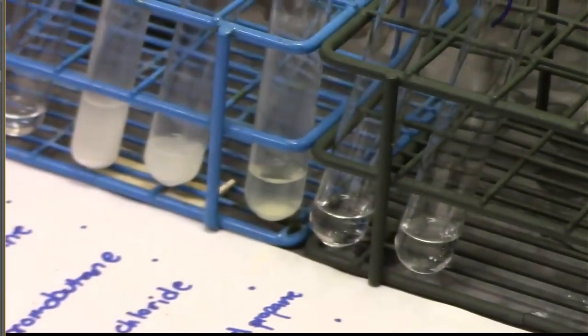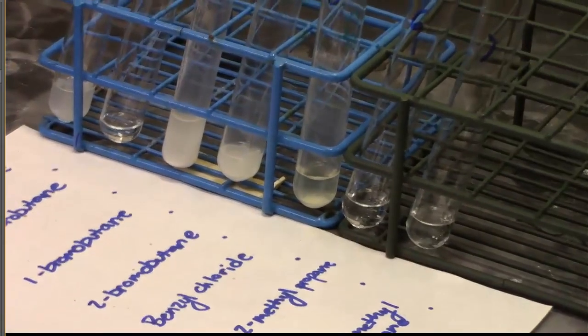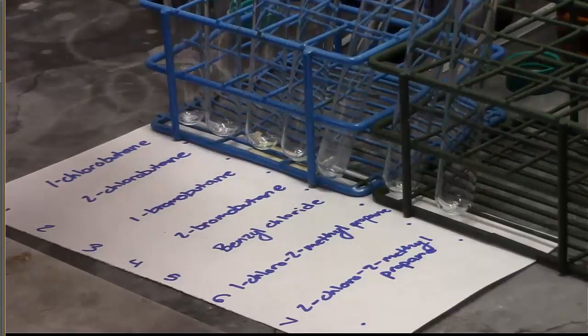For the remaining reagents, our 2-chlorobutane did not go, or 1-chloro-2-methylpropane did not go, which is surprising because that had a primary substrate. And then our tert-butyl chloride, or our 2-methyl-2-chloropropane, did not go either.